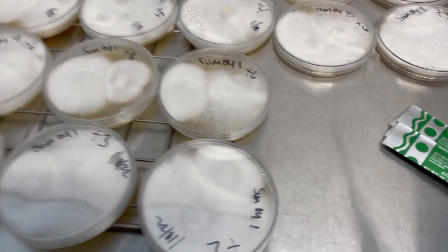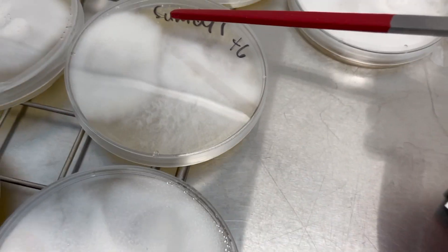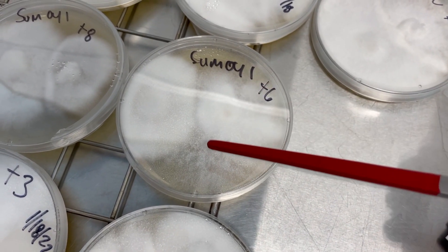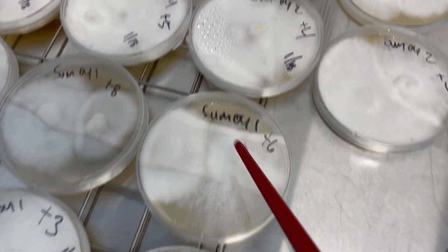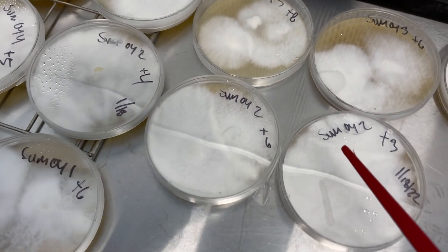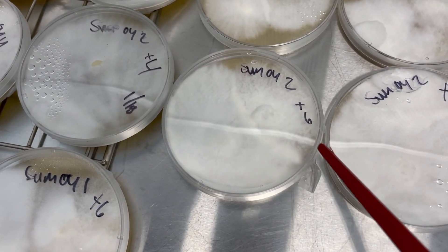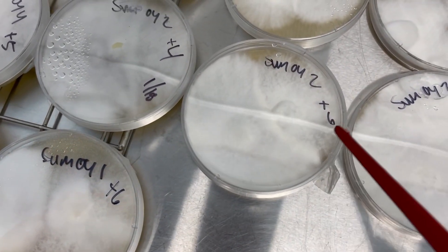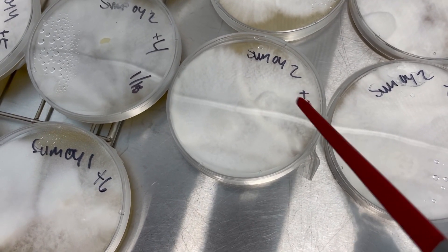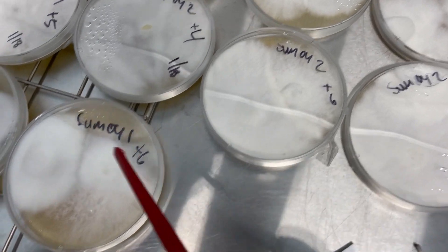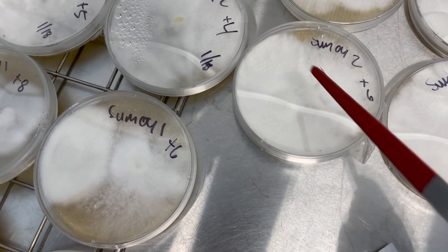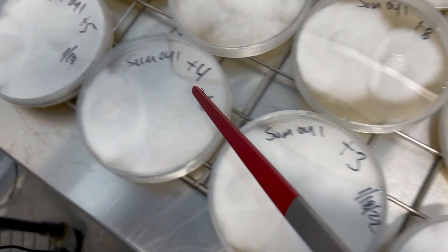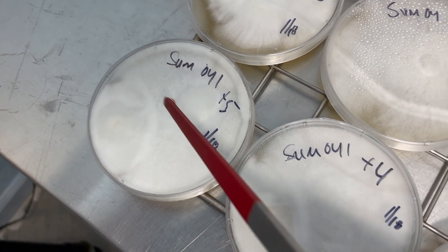That's a pretty good band right there. So you can come over now to one in six and notice how there's this gap right here. So that is what is called the zone of inhibition. So you can see one and six are not compatible, but if you come over here we've got two and six compatible. So that tells us that this six is most likely a haploid still. I mean there could be mutations that happen, but the fact that it's pairing here and not pairing here means that these are incompatible.